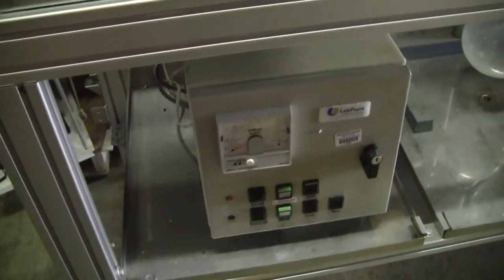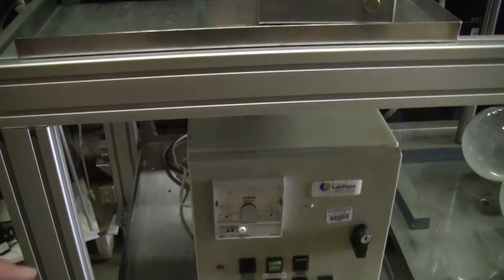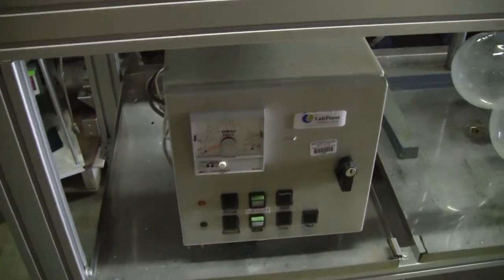Control panel, measuring your vacuum, turning on your vacuum pumps, accessories.